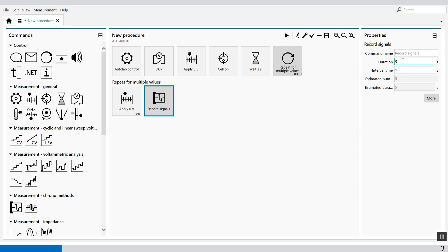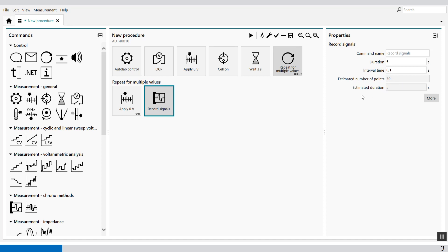The record signals are set for 5 seconds with an interval time of 0.1 seconds, giving 50 data points. Since we're interested only in the last 10 points of each measurement, we have to window these values. This is used as a data extraction method. To calculate the average of the current, potential and power of the last 10 points of each step, the first step is to extract those 10 last points from each measurement.